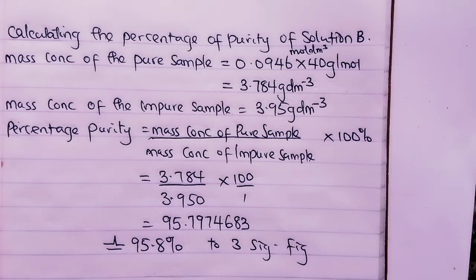As the teacher is trying to measure the sodium hydroxide, since it is a deliquescent substance, there is no way the teacher will be all that accurate to make a titration that's going to give you 23.2, and that is just the truth, because there must be absorption, except if that place is well airtight, which is not that possible.